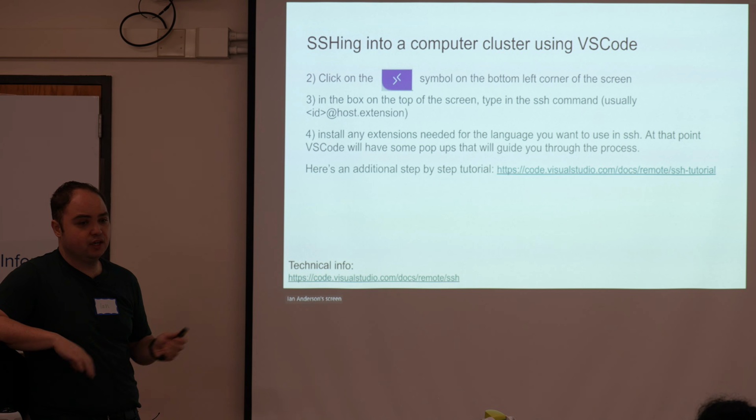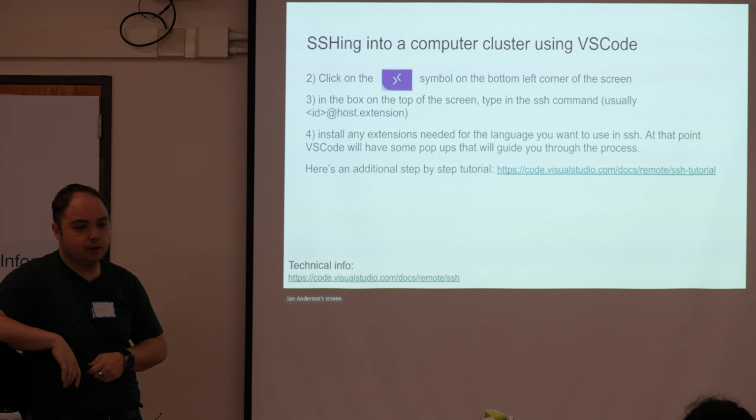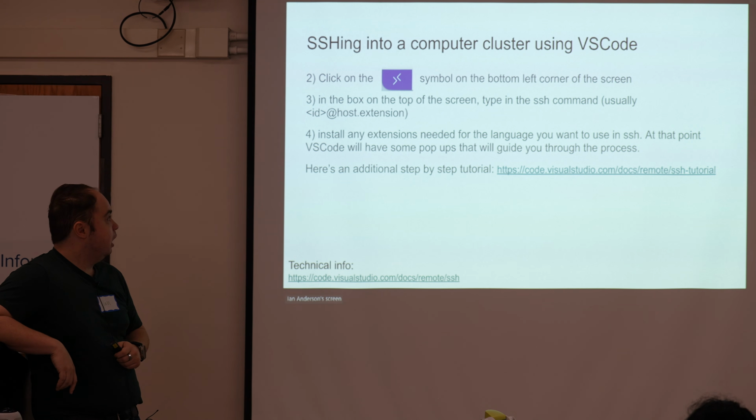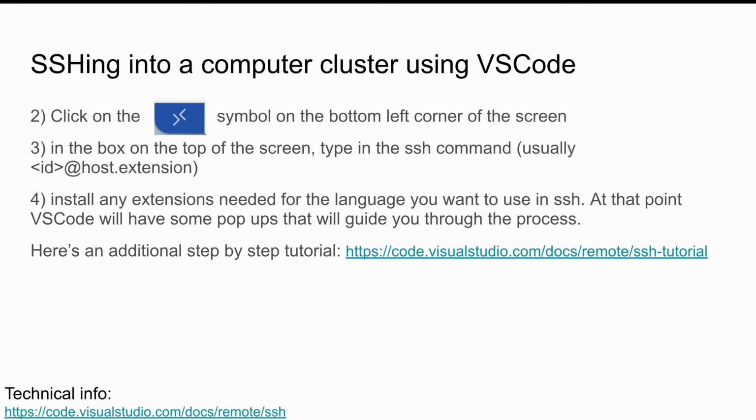But again, there are a lot of tools that can do this. Cyberduck is a really popular one. You're welcome to use your preferred method. And then here are instructions for how to set that up. I'm not going to go over it, but if you wanted to set it up, you're welcome to go into the Notion site and pull up these slides, and you can use this to help you set it up.